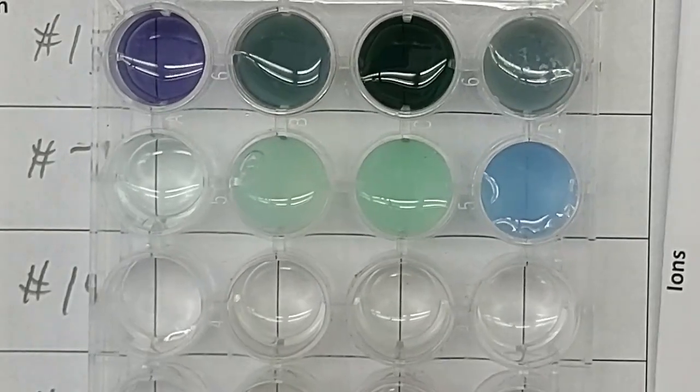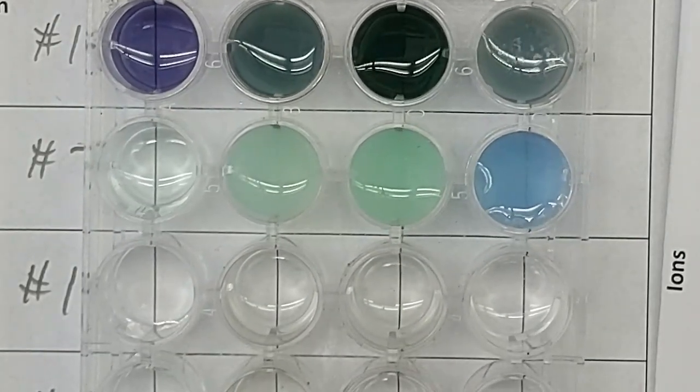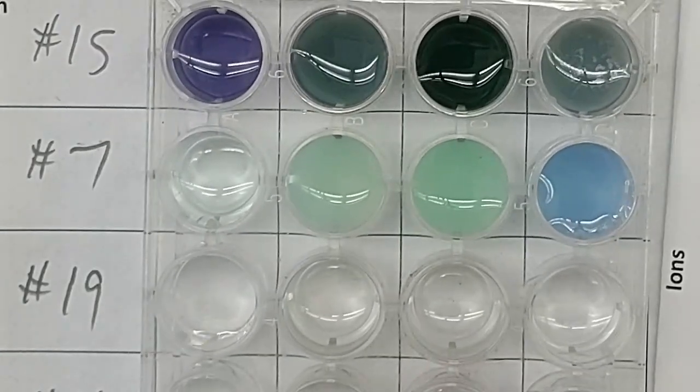And I'll move it so you can see whether you can see through the line or whether it's transparent or not. And match it to one of your previous observations.